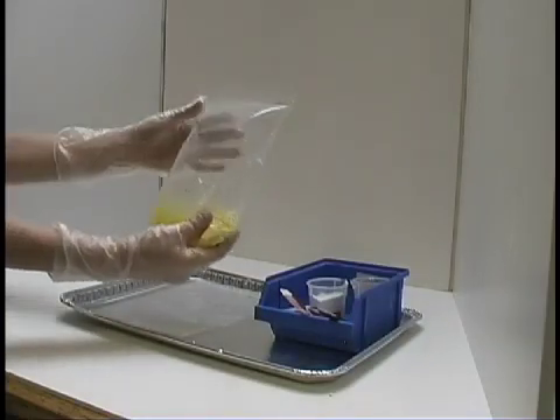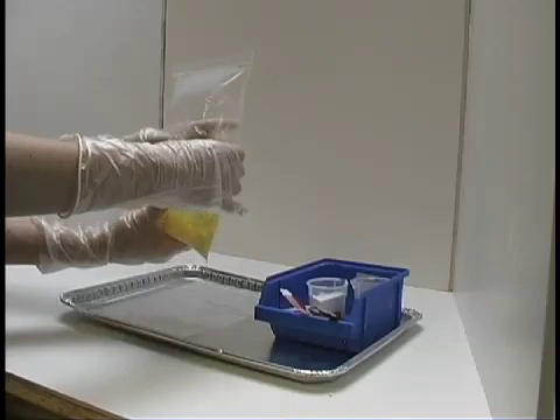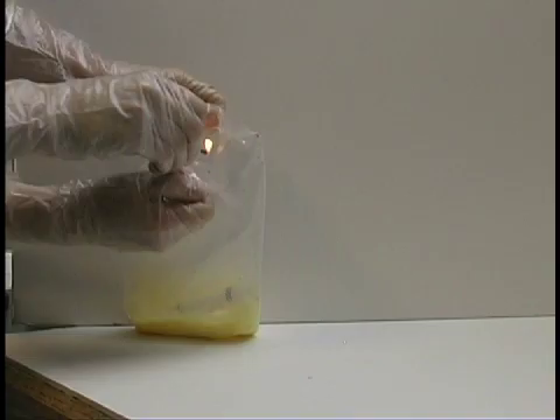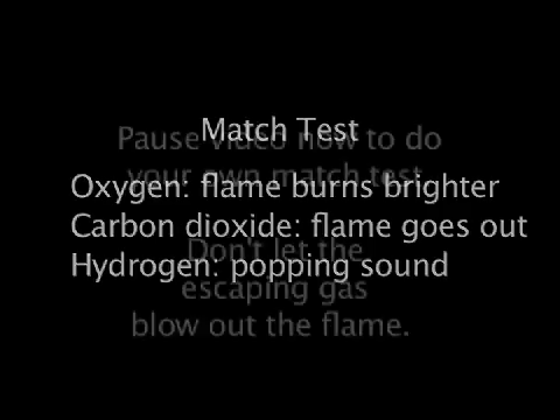After a minute or two, you should release the gas in the bag so it doesn't pop the bag open. Your teacher can light a match and hold it inside the bag when you open it to determine what gas is produced. If it is oxygen, the flame will burn brighter. If it is carbon dioxide, the flame will go out. If it is hydrogen gas, you will hear a popping sound.